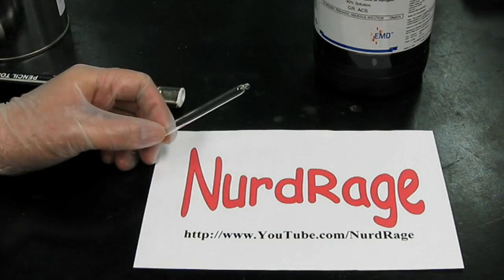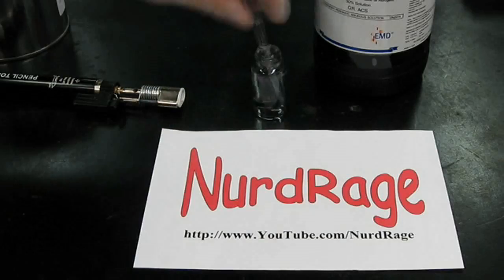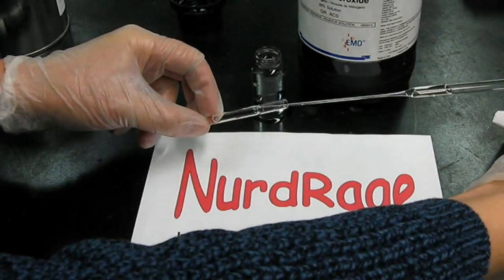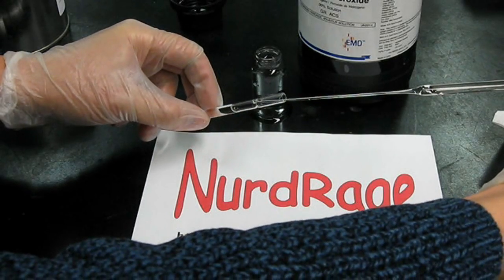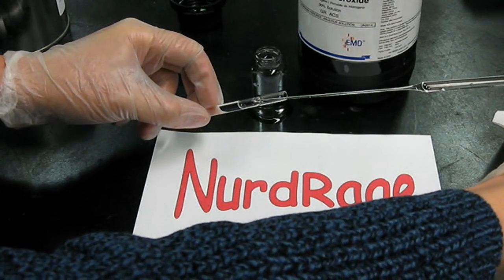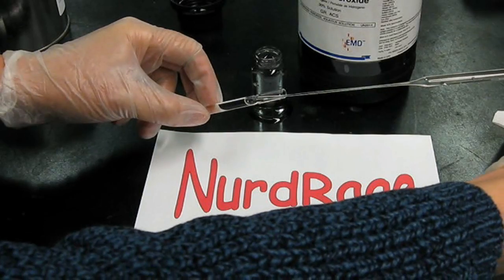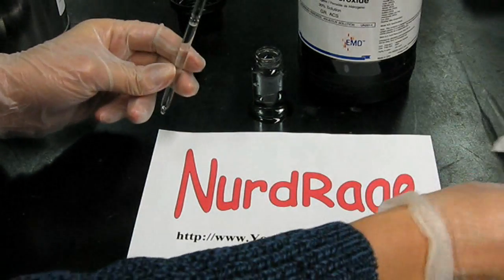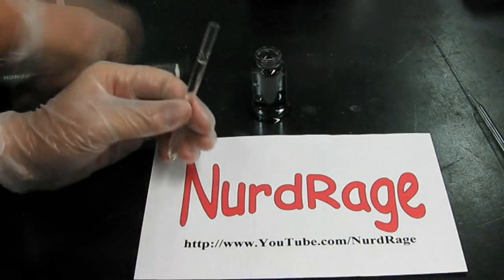Wait until the tube cools to room temperature. When it's cool, fill the tube with 30% hydrogen peroxide but leave about an inch empty from the top. You need this gap so the peroxide doesn't boil from the heat when you flame seal it later. Once it is filled, flame seal the top.